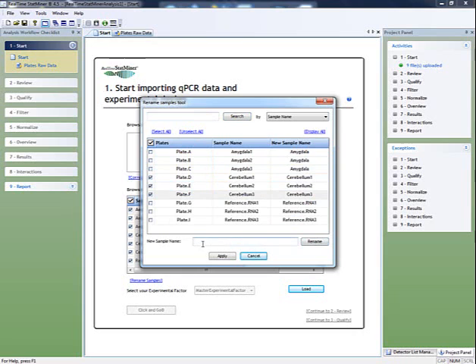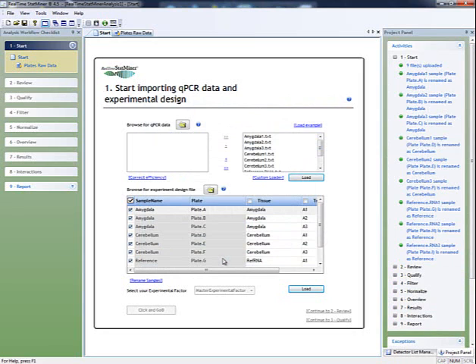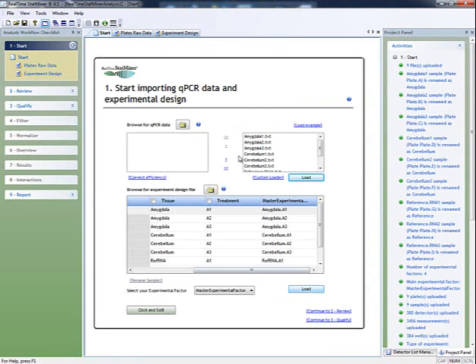As suspected, this Rename Sample tool can also be used to rename confusing sample names. So now that we have given the same name to the technical replicates, what will happen is that StatMiner will run an analysis consisting of 3 different tissues with no biological replicates. A very similar case, where samples with the same name on different plates should be treated as biological replicates, can be fixed by proceeding to rename each sample.